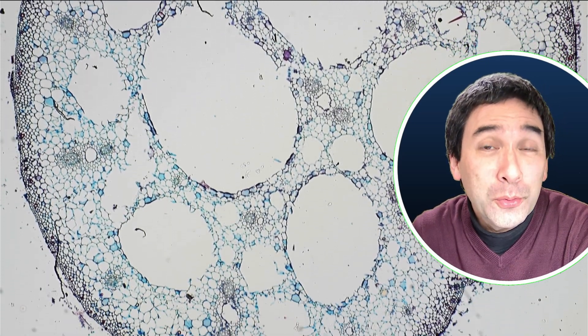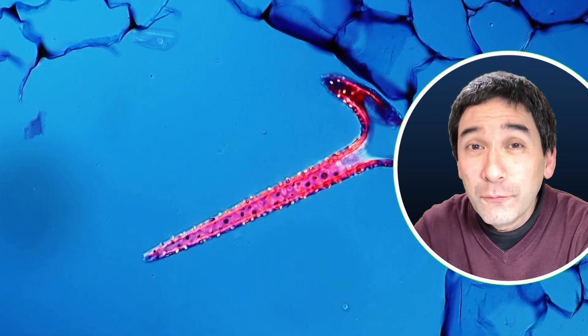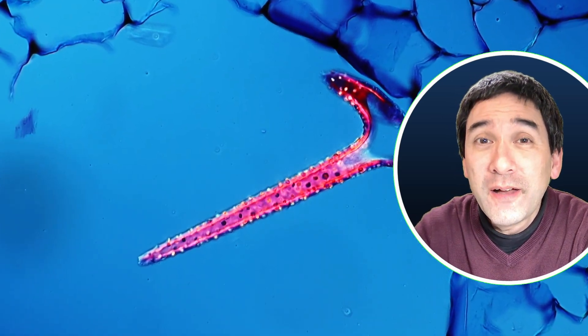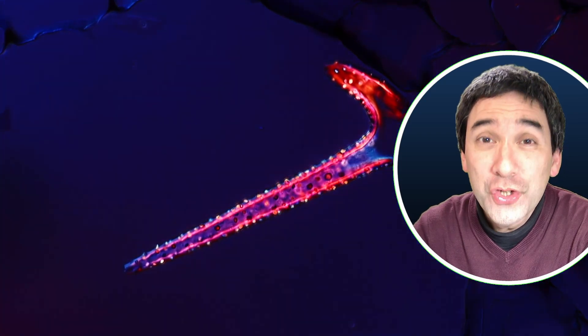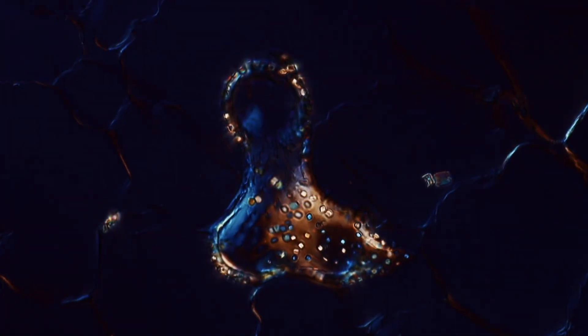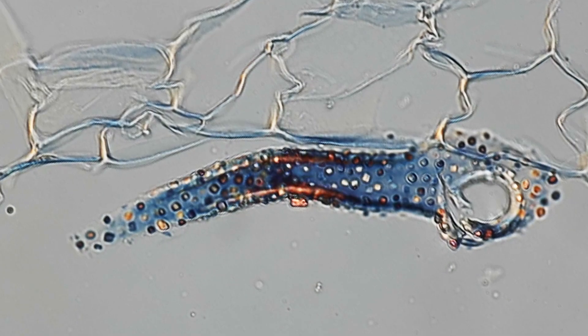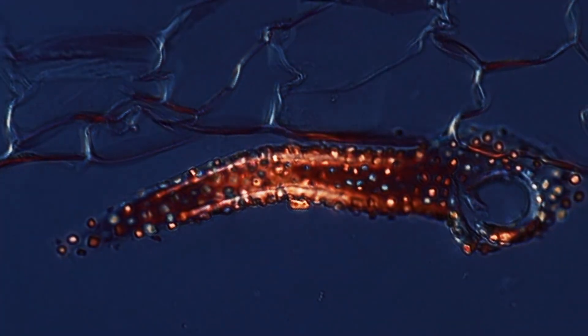Now the specimens were prepared in different thicknesses - some thinner, some thicker. If you look carefully, you're able to identify those very colorful, strange, elongated structures. These structures have an interesting name: they're called idioblasts. Idioblasts are all of those cells or groups of cells that are different from the surrounding cells, so it's a relatively general term. These idioblasts are responsible for making those calcium oxalate crystals that we can see now under the microscope.